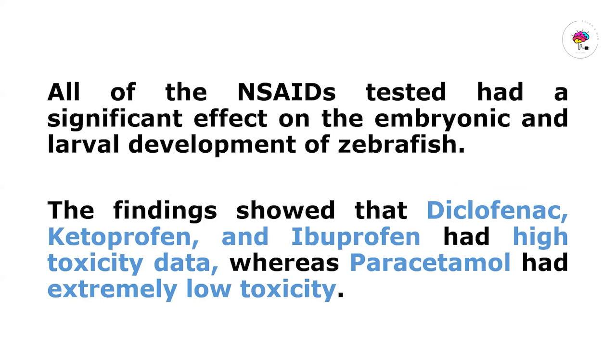In conclusion, all of the non-steroidal anti-inflammatory drugs tested had a significant effect on the embryonic and larval development of zebrafish. This finding showed that diclofenac, ketoprofen, and ibuprofen had a high toxicity, whereas paracetamol had low toxicity.